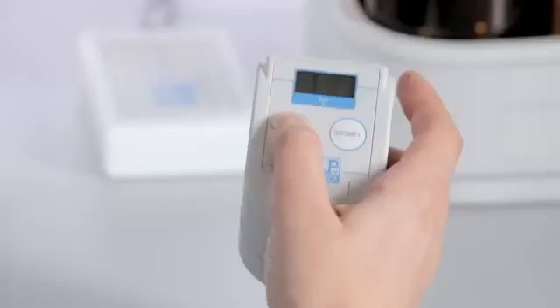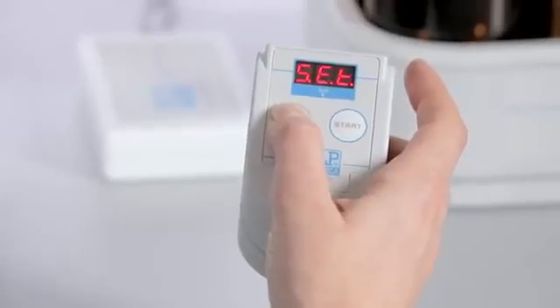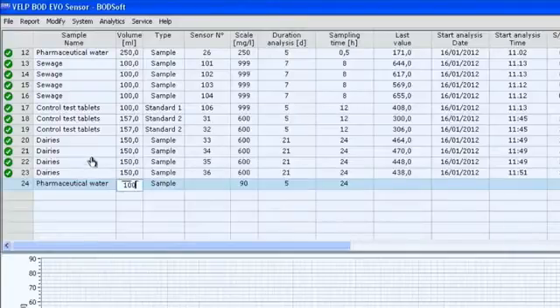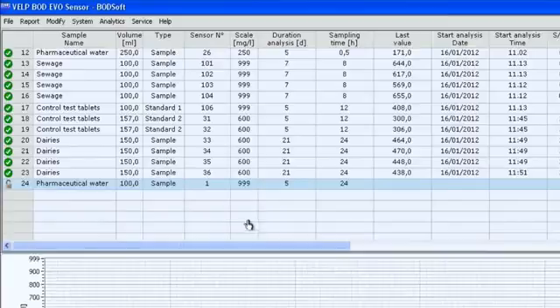Parameters required before starting the test include sample name, volume, scale, duration of the analysis and sampling time.